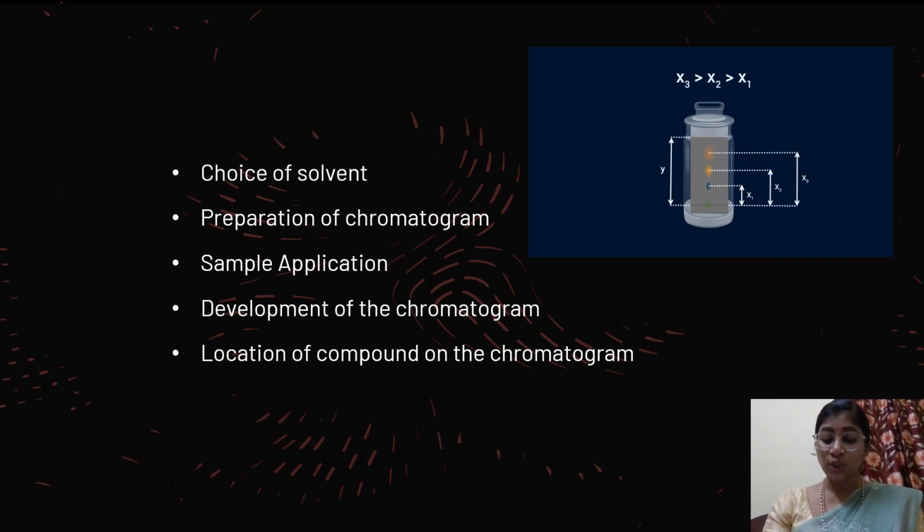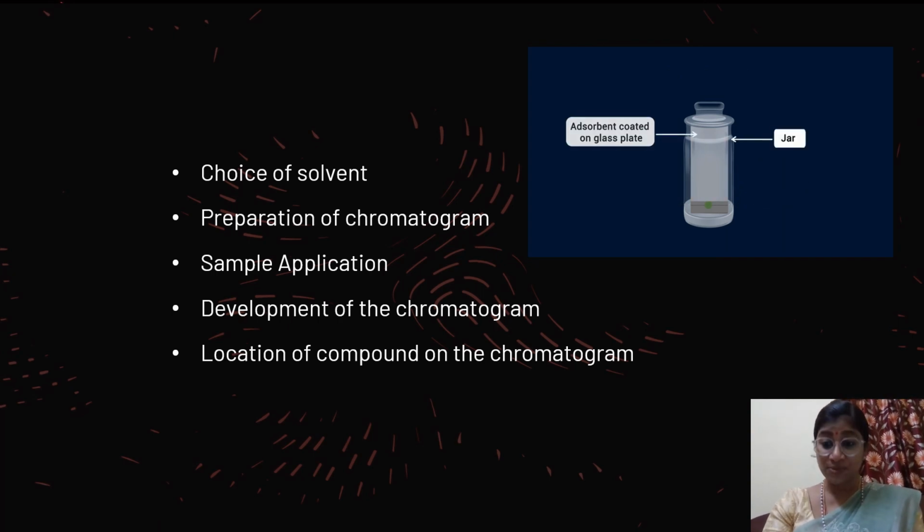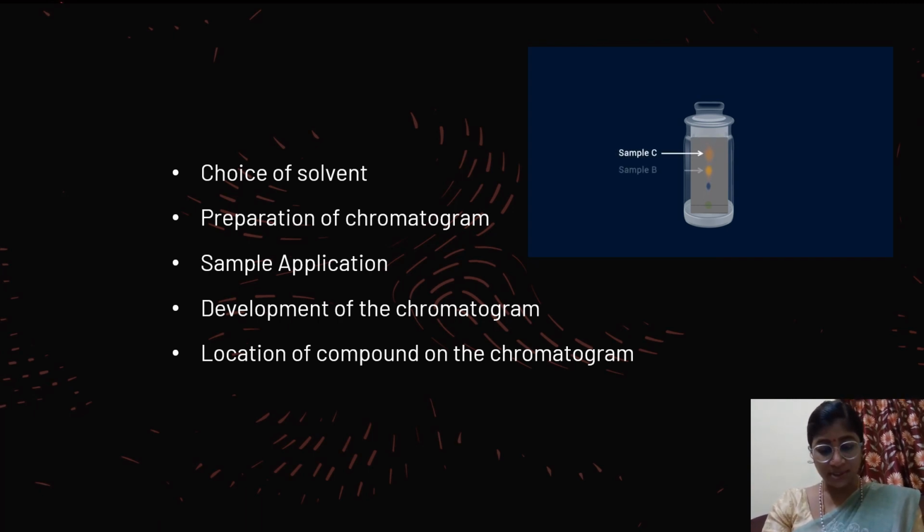Water is sprayed on the chromatogram. Hydrophobic compounds show their presence as optically dense waxy areas. The developed chromatogram is inspected under UV light in a darkened box. Many compounds appear as dark spots on the light background. Crystals of iodine are placed in the tank during development. It imparts a dark brown color to the spots.